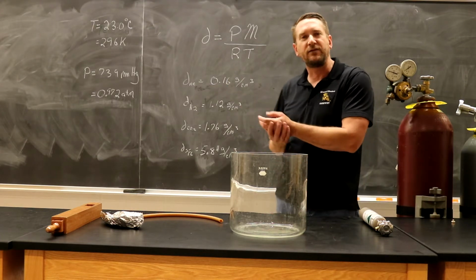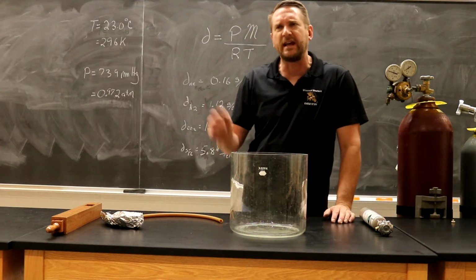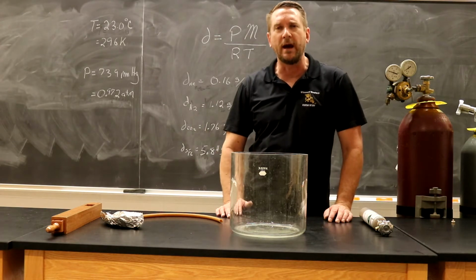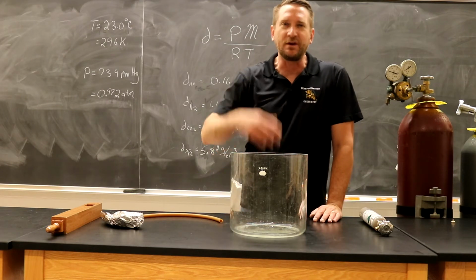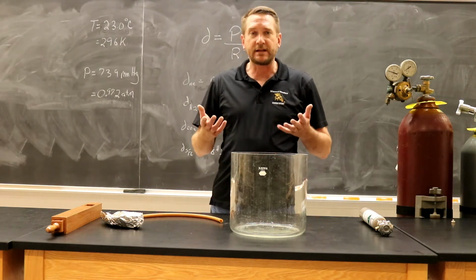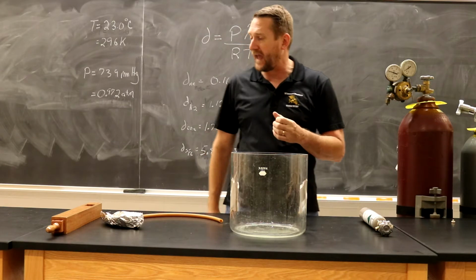Now, at the end of this video, I'll do some of the calculations. So if you're interested in how to calculate the density based upon the laboratory measurements, I'll show you that at the end. If you just want to watch for the fun science, then you can skip that at the end. So let's start with some densities of gases.